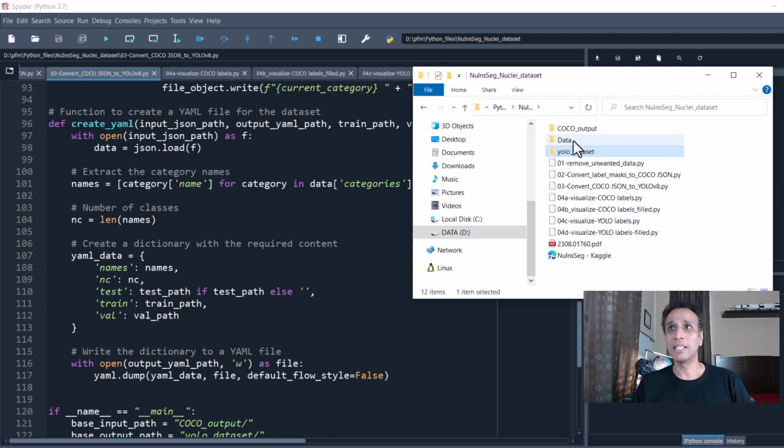when I created these, initially I was super happy. I'm like, okay, so I got this. Let's go ahead and train. But how the heck do I know that the annotations are written correctly? Did I mess up? It's always a good idea to view your annotations before you go and waste your time. Well, I should say spend your time if the annotations are correct, or waste your time if the annotations are wrong, right? In terms of training. So let's go ahead and visualize this.